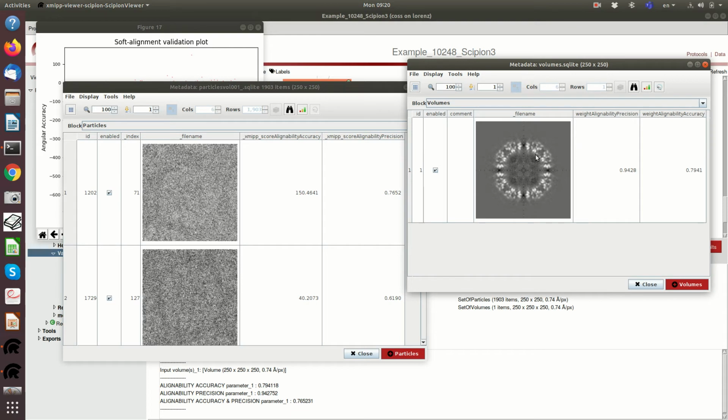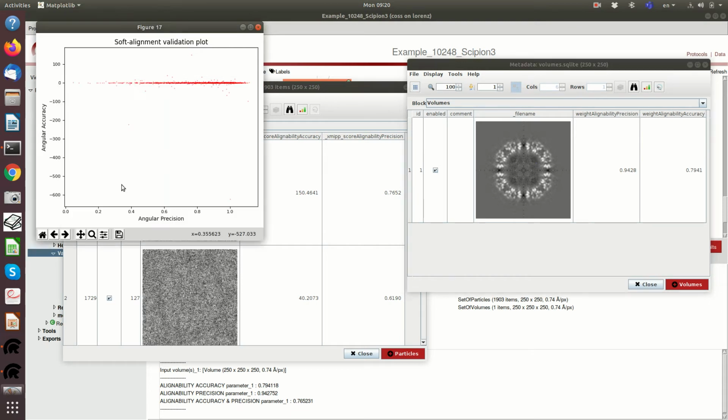One of them is not bounded, so that is why we have this minus 400 or minus 500, whatever. This is because for just one image this measure was terribly bad, but we can zoom in on a region between 0 and 1.